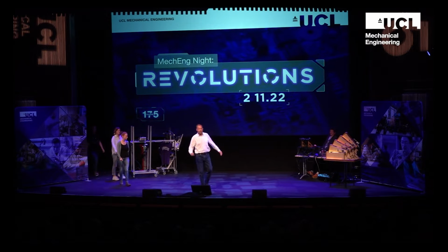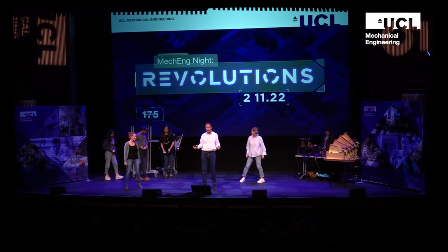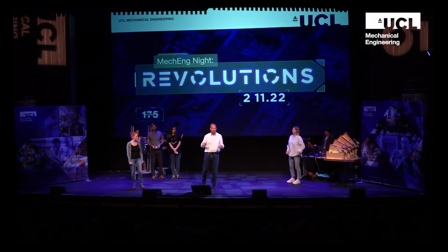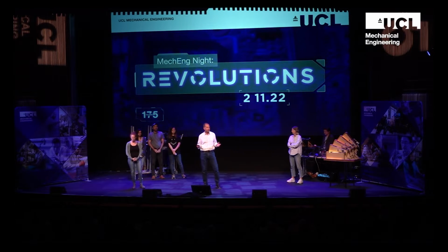Good evening, everyone. In the next few minutes, we'd like to tell you about a revolution that started right here in mechanical engineering. It was inspired by our German medical collaborators who called up in March 2020, in the middle of lockdown, and said, can you help us quantify the damage that COVID is doing to our bodies? And what we did is come up with a whole new X-ray technique that lets you see inside yourself, that inner universe, not just the outer universe, like we've never seen before.